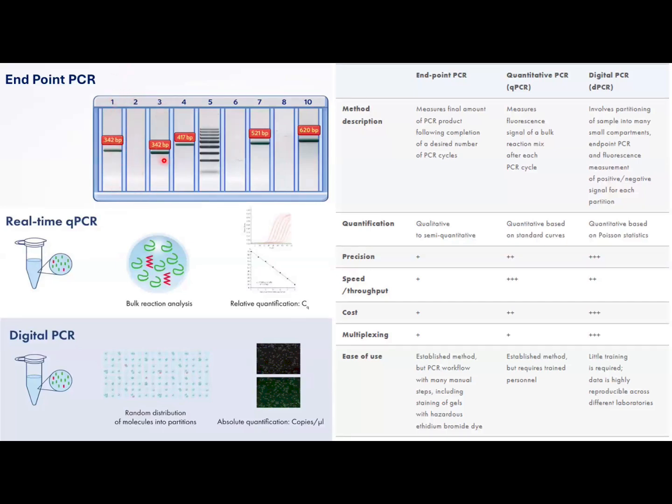This is the negative control, positive control for E13A2, E14A2, and ladder. This is how the entire experiment is set up. The advantage of this particular test is that it is very cost effective. It hardly costs 500 to 600 rupees. The ethidium bromide gel electrophoresis is very cheap and very easy to use, user friendly also.